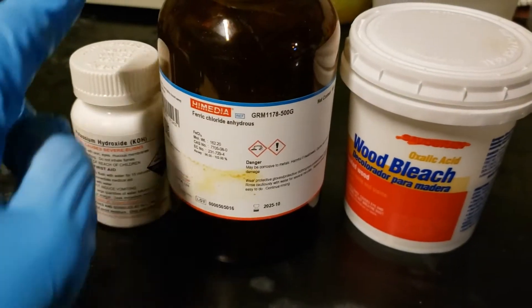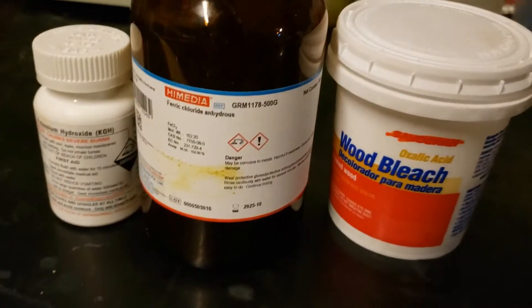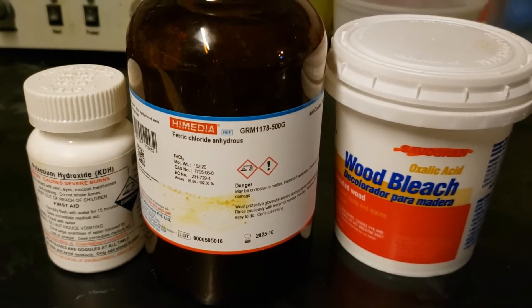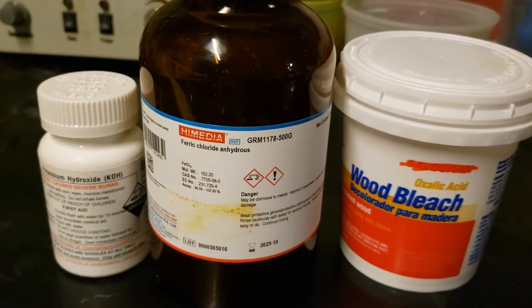In terms of chemicals, you'll need potassium hydroxide, anhydrous ferric chloride, and oxalic acid dihydrate. Oxalic acid dihydrate is available over-the-counter as wood bleach. Also, you may use hydrated ferric chloride if you wish, but the molar amounts will be different.